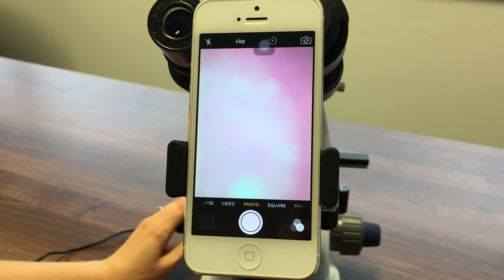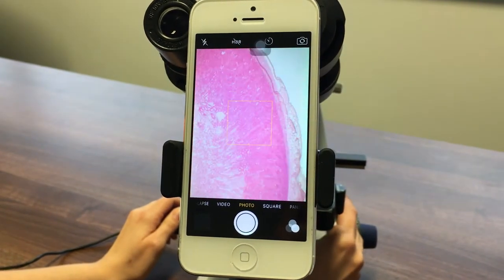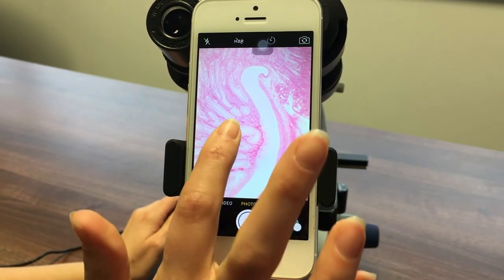Focus your microscope using the microscope's focusing controls whilst looking at the phone screen. You may need to zoom in for the image to fill the screen. Lastly, focus your camera phone before taking your picture.